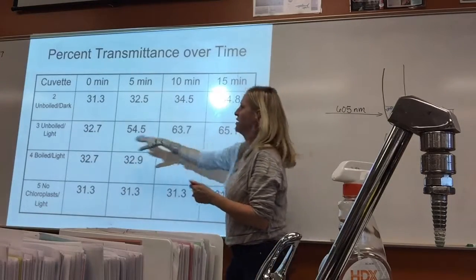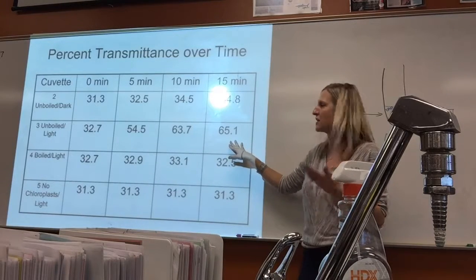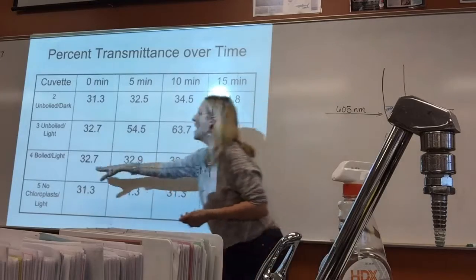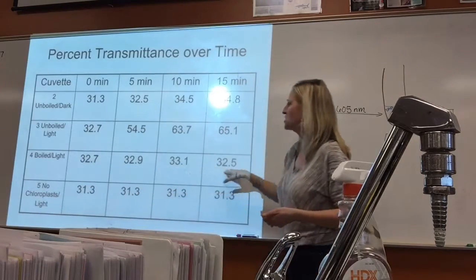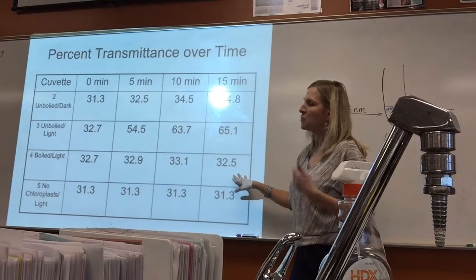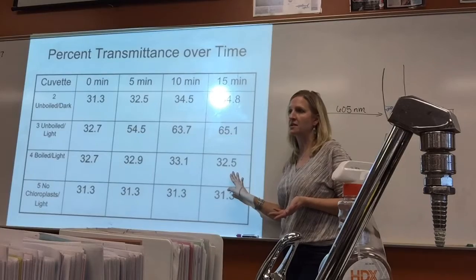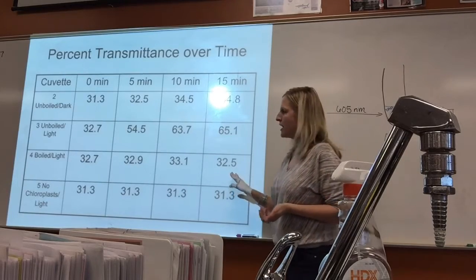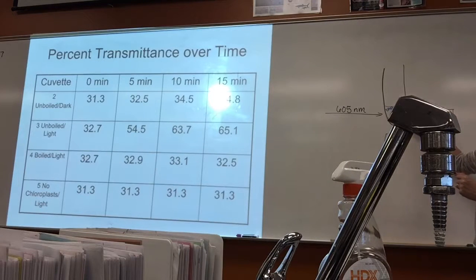Unboiled in the light, huge percentage increase. Is that what you would expect? Yes, because there's nothing stopping photosynthesis. And then boiled in the light. Now notice that we get some fluctuation here. Did you expect the boiled chloroplast to have much photosynthesis? No.